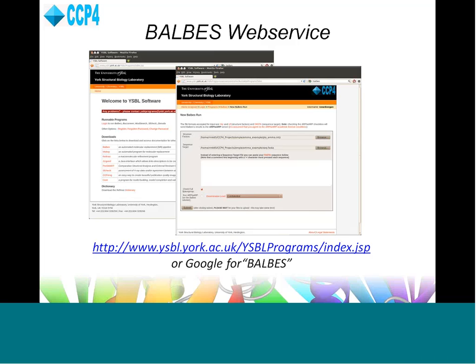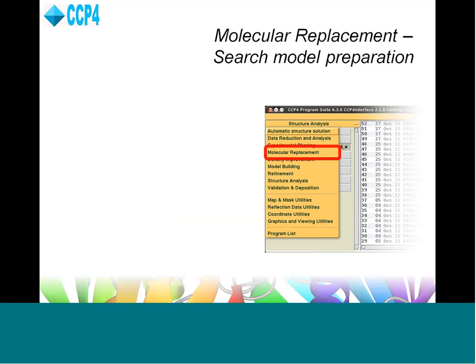But in terms of comparison, the best advice I can give you is to try both of them, really, if you have a difficult molecular replacement problem. In molecular replacement, search model preparation is always an important thing. It can make the difference between success and failure.